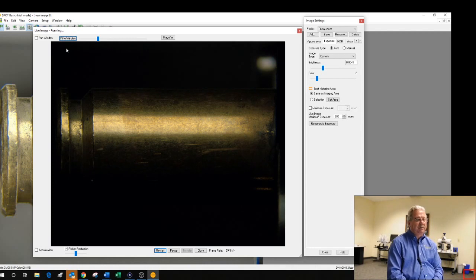I'm sorry, that was just a common feature that I thought of while we had that live imaging window out. Michael, if that doesn't address your questions, then give me a call separately when you've got the microscope in an image too dim position, and you can put that up there.